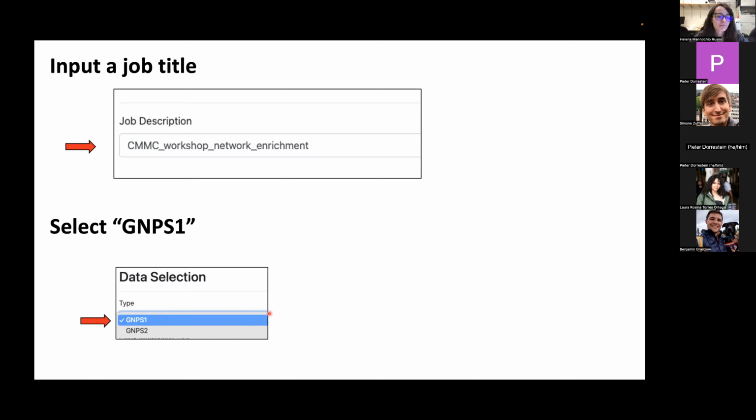In a few years, we'll phase out GNPS 1.0. Currently GNPS 2.0 is being developed. The idea is that we improve the tracking. I mean, the foundation of GNPS 1 has code from back in 2007, so it needs an upgrade to be compatible with future faster searches and better tracking of all the data that's in there.